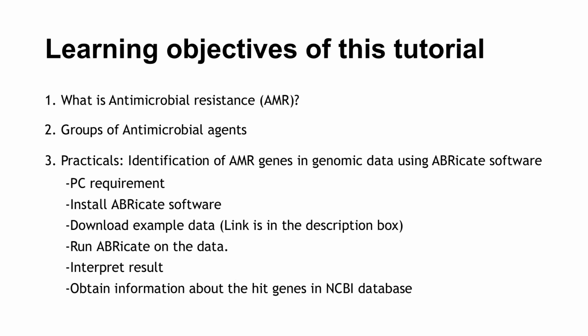Install ABRicate software, download an example dataset, run the ABRicate software on the data, interpret the results, and finally, obtain additional information about the hit genes in the NCBI database.